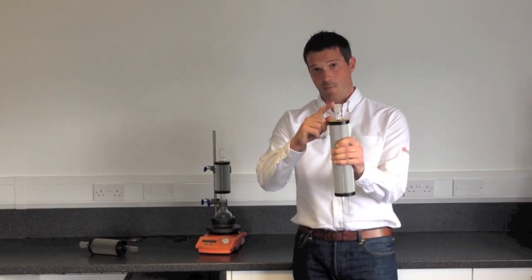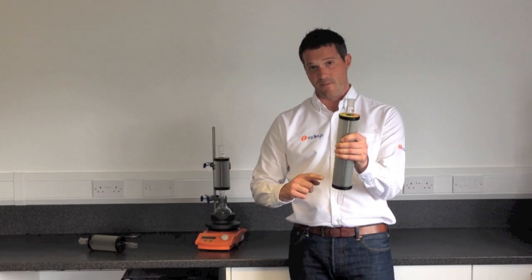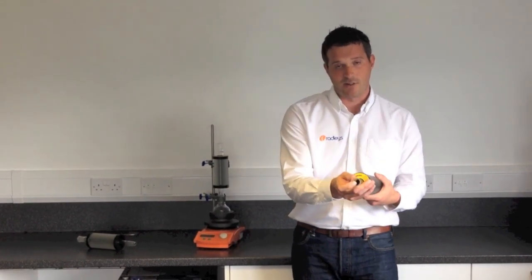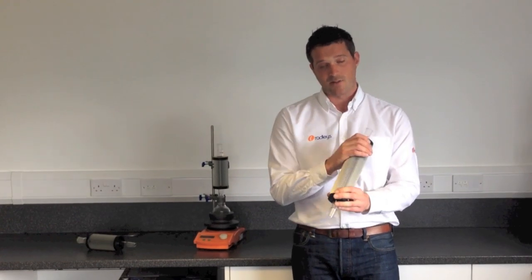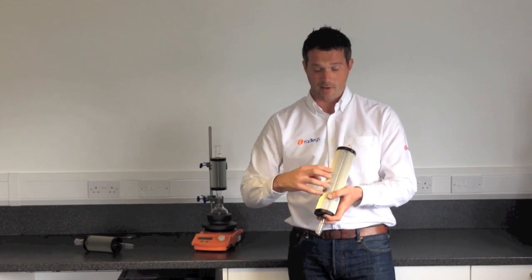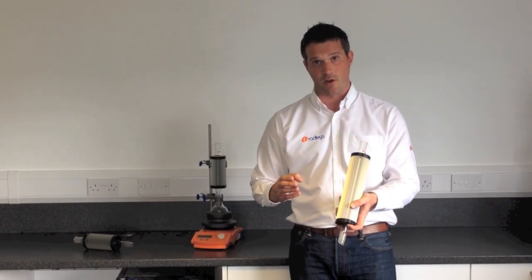Inside the Thindenser is a glass tube that runs right the way down the centre. It's a vidrio type column so there are lots of indentations inside and lots of surface area. Outside is an aluminium jacket which has fins and ridges all the way around, so there are lots of surface area on the outside too.